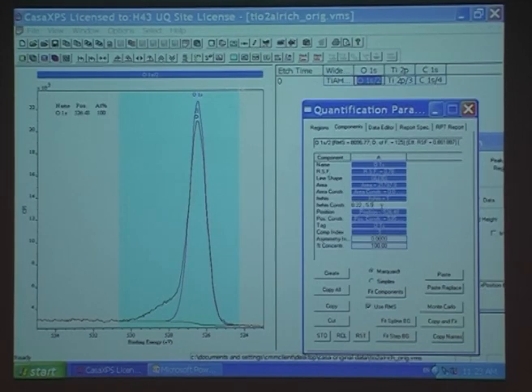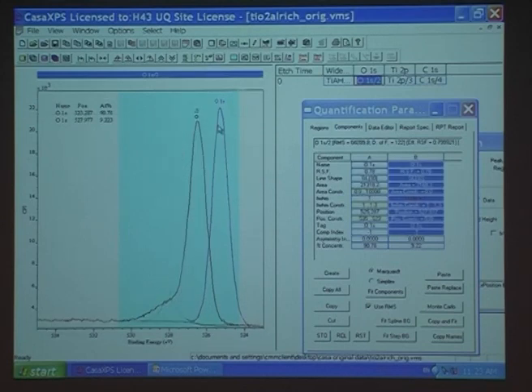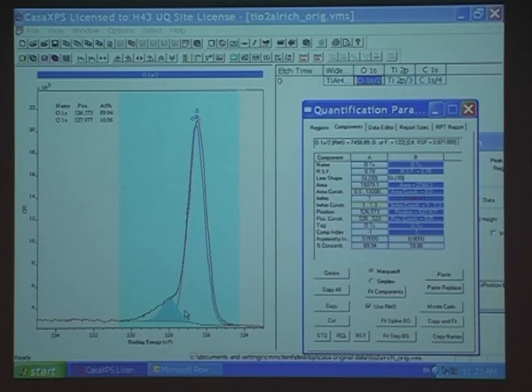I've made a note here, probably 1 to 1.3. So I'm going to not let it go any more than 1 is the minimum, 1.3 the max. And a simple, do the same thing again, copy and paste. Bring this one to the side and bring the new one down into here. Now, looks like I've got another one. So you use the fitting a bit to establish how many. The width's so critical. If I had this at 1.5, it wouldn't fit there very well, but it probably fit this with two peaks, which isn't correct.